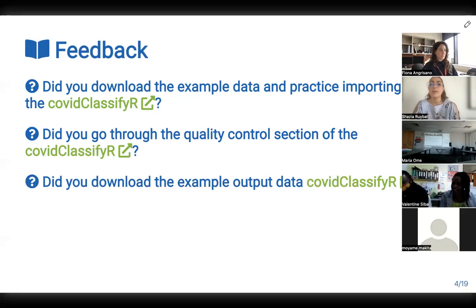All right, and then the last question was, I know I gave you homework last time. By no means did I expect you to do it if you had so many other things, but did you also download the example output data of what it should have looked like?